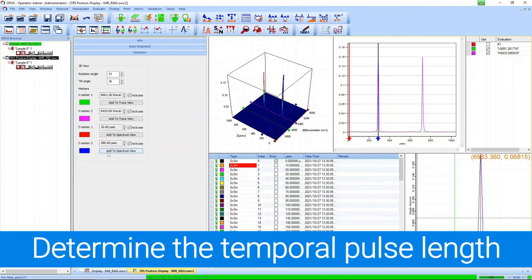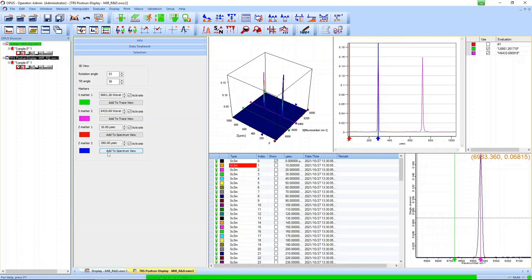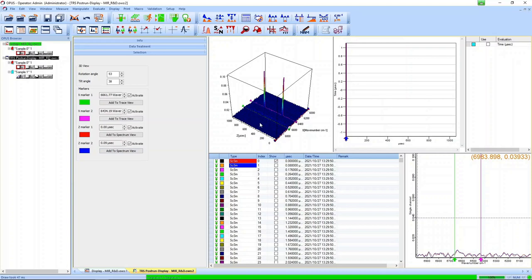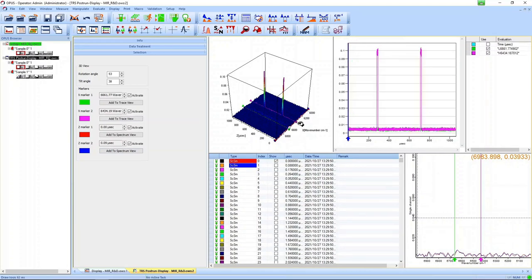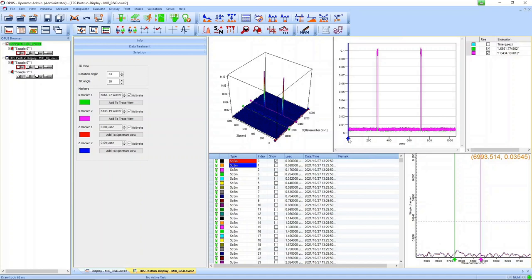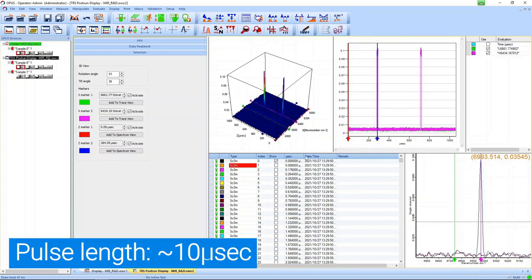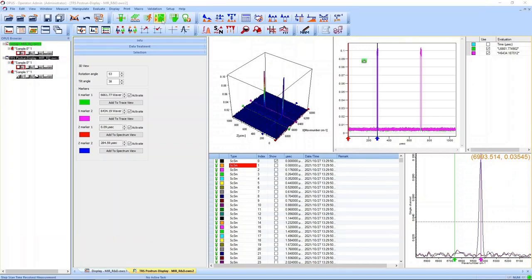After the measurement finished we see that the noise is a little bit higher now, but we see the same two pulses at the same positions. The noise is higher because we now use the fast components. But we can now see that the temporal profile of the pulse is more like a plateau. The pulse length is around 10 microseconds.